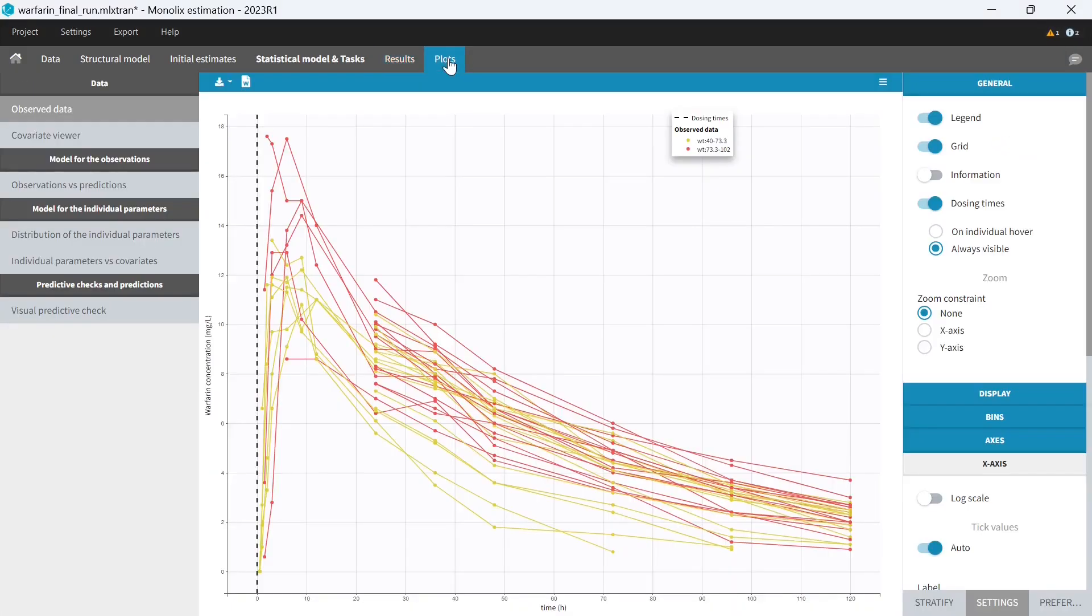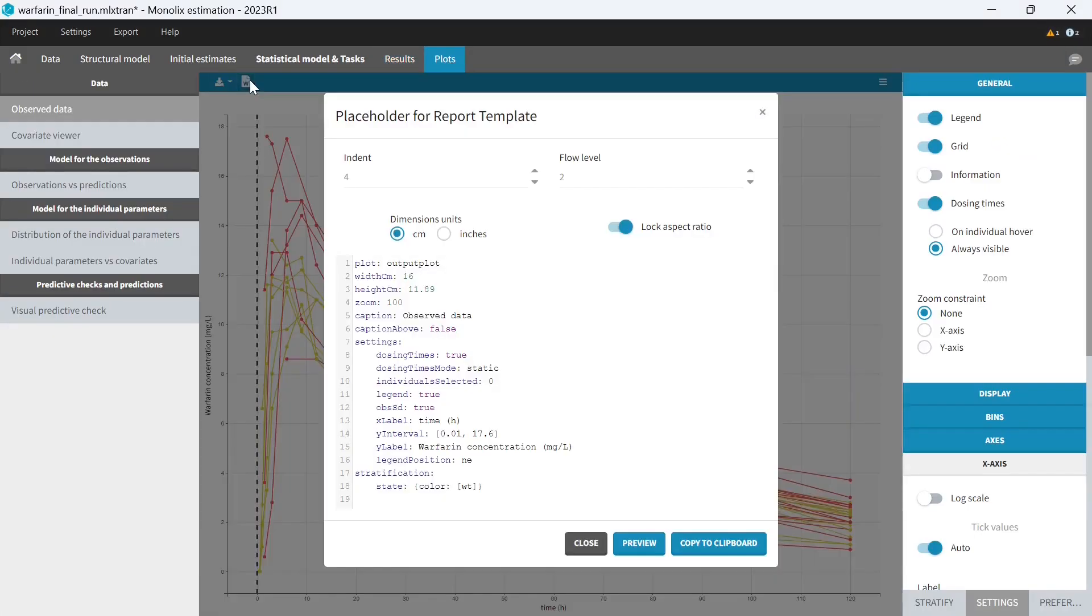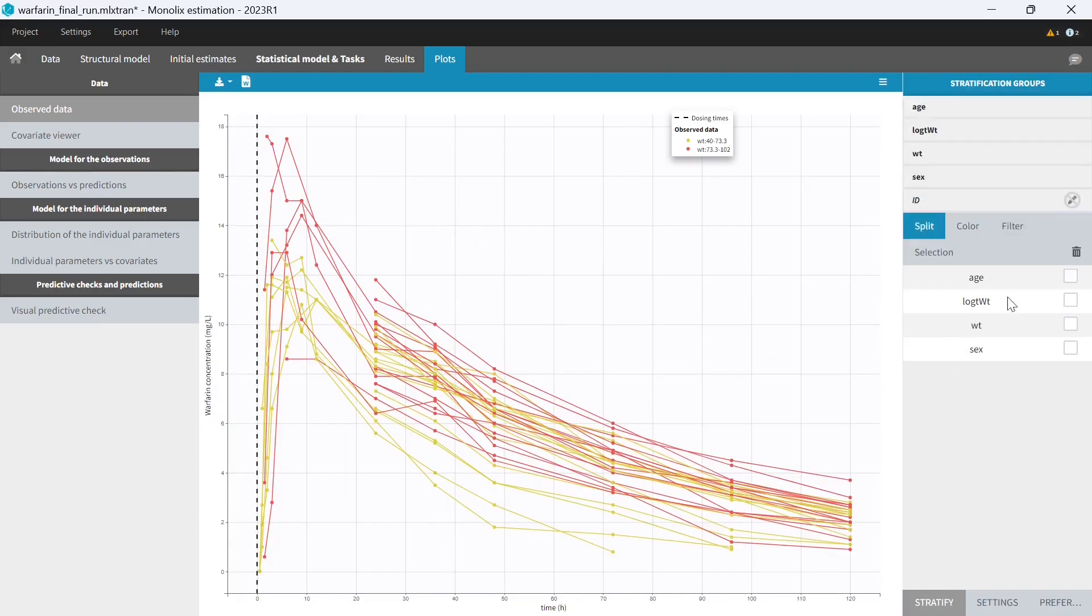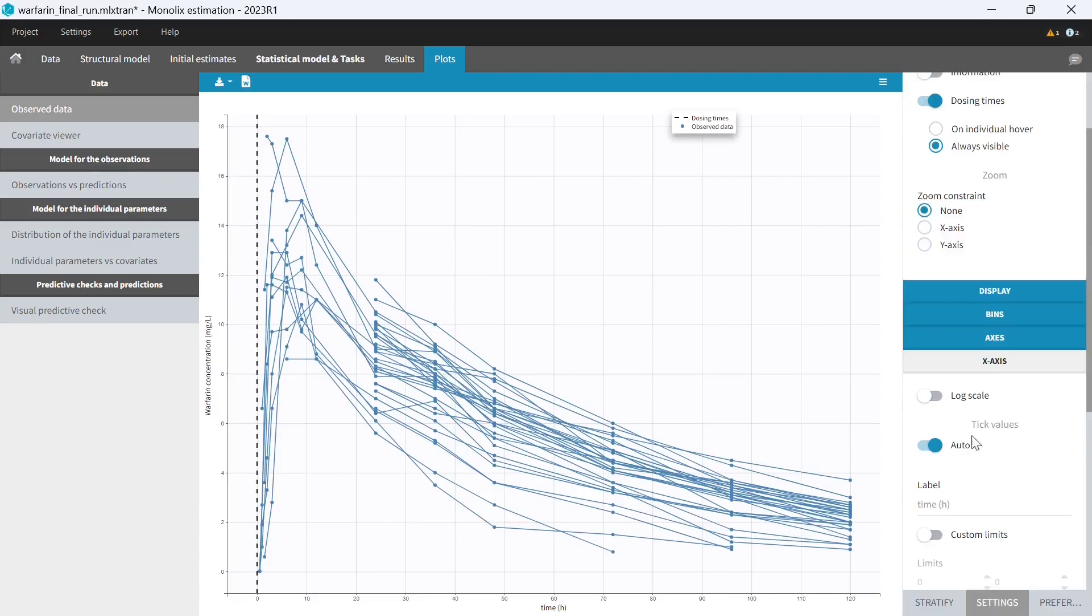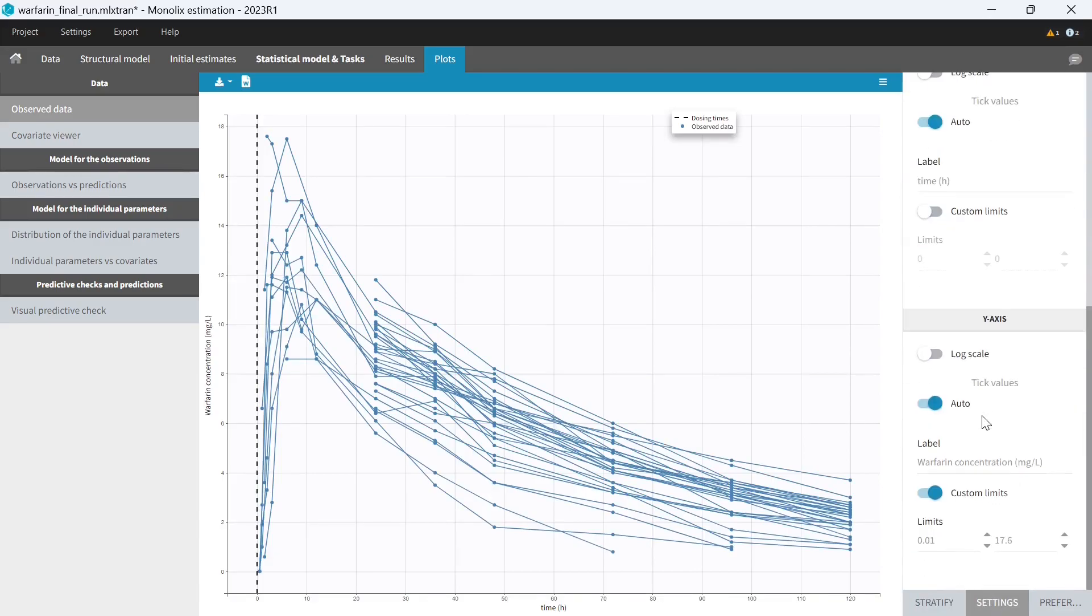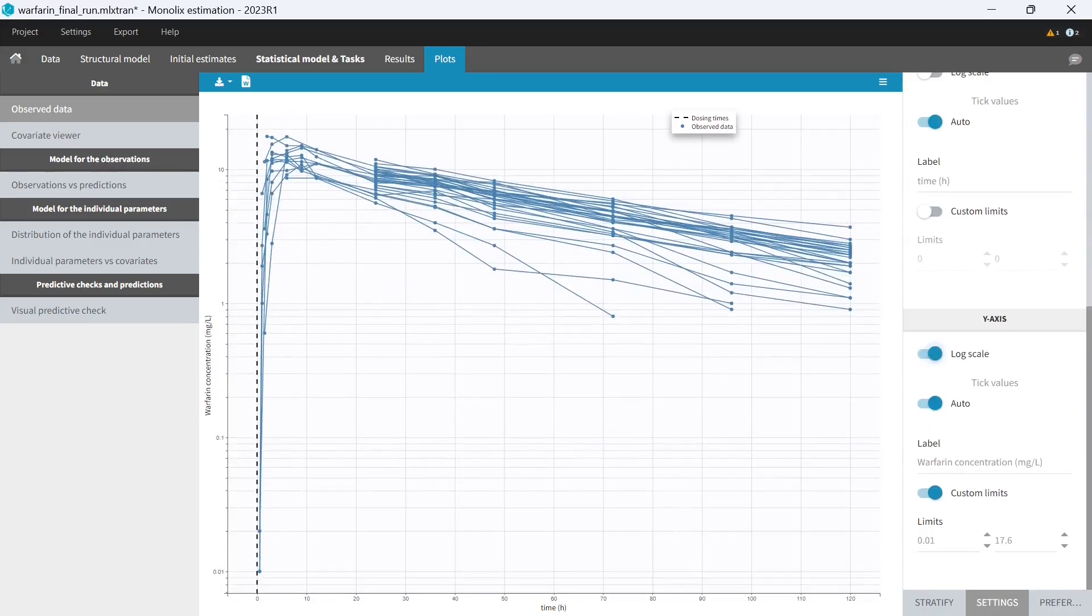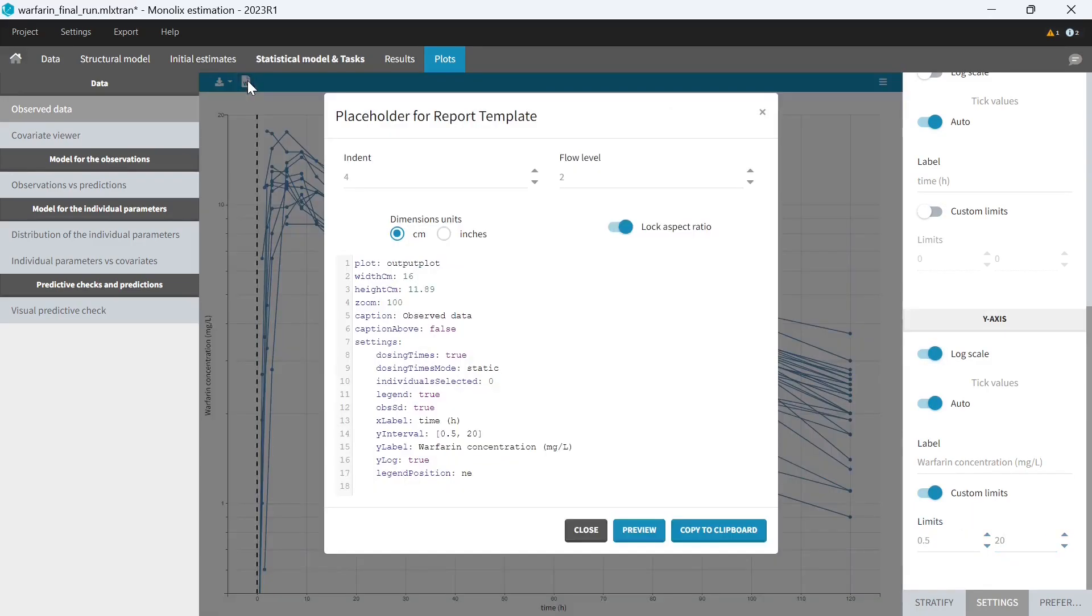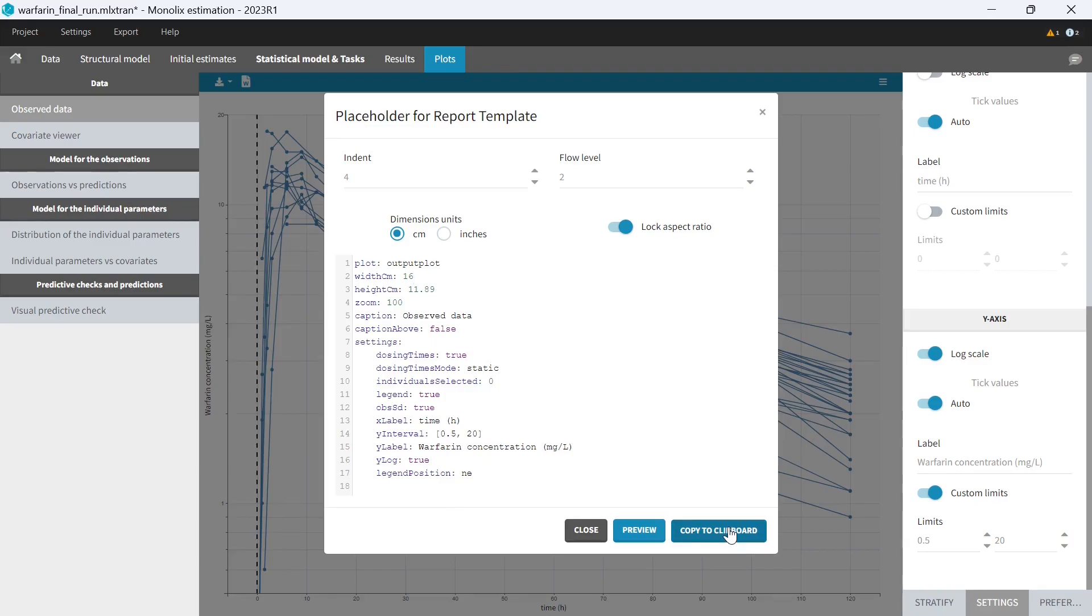For example, we can look at the observed data. The placeholder encodes all the customization done in the interface. If I change the plot settings, for example, to remove coloring, set a log scale on the y-axis, and focus the axis limits on the elimination, the placeholder is updated. You see that I have a log scale on the y-axis, axis limits updated, and there is no coloring by weight anymore in that placeholder. I could copy this new placeholder into my template to show the observed data in log scale in addition to the previous observed data plot.